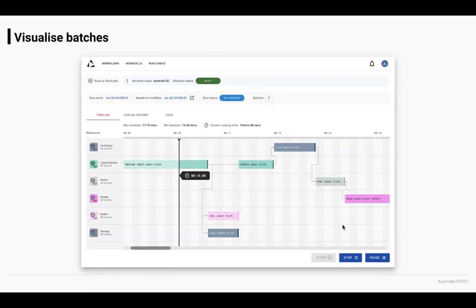And then it will go, okay, so you need to do 2 plates and you need to prepare your Qubit assay on this liquid handler. So once it's finished on this liquid handler, I know that it's free, and then I know that I can slot it in here. If you're interested more to hear about our software, definitely get in touch. This isn't like the focus of this webinar, but there's some really cool features and a lot to talk about.